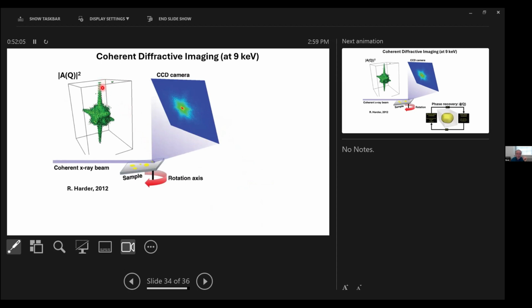These little bumps of intensity here are the truncation fringes from a crystal which has a nice faceted surface. The Fourier transform of a step function is a whole bunch of oscillatory fringes.